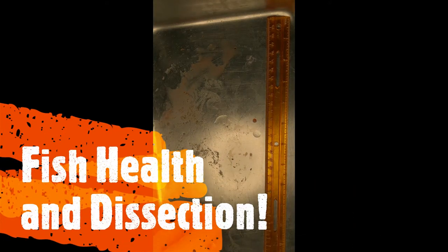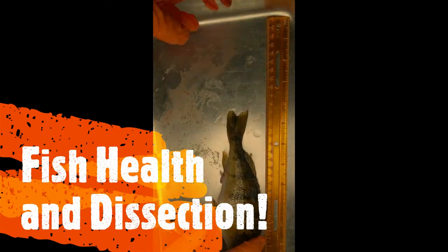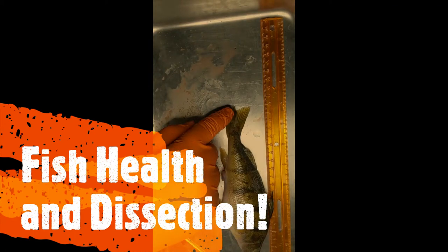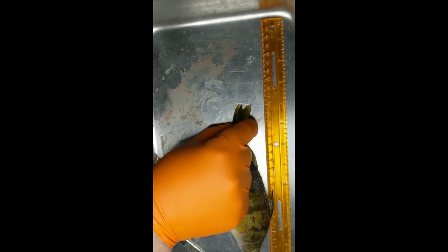What we're going to be doing today is taking a look at a fish, doing an overall health survey and harvesting its liver for a vitellogenin study down the road. The first step is to get the length and weight of our fish and record these in our notebook.